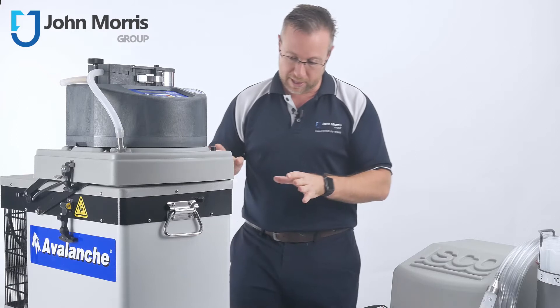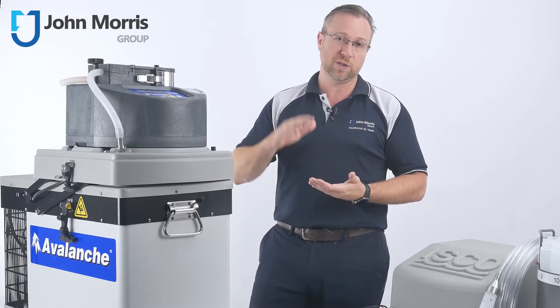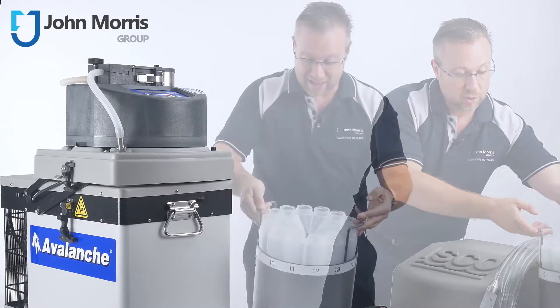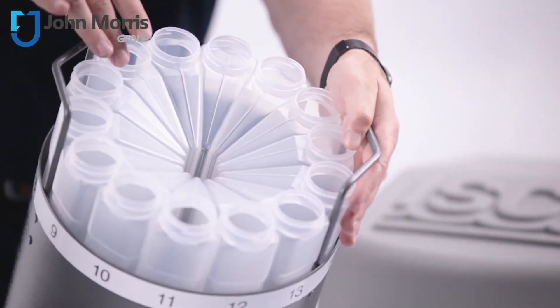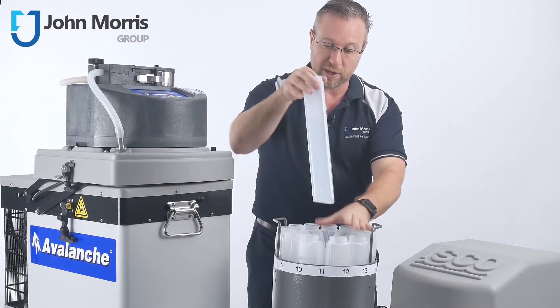This sampler can take up to 14 bottles, or it can also be a composite bottle solution with a single poly bottle or glass bottle. When you run with the multiple bottle solution, it looks a lot like this — you have a container and the 14 bottles simply sit in directly like this. These are poly bottles just under one liter.